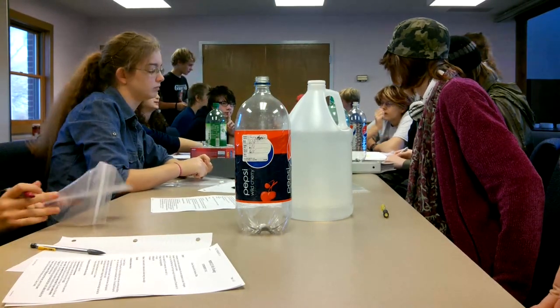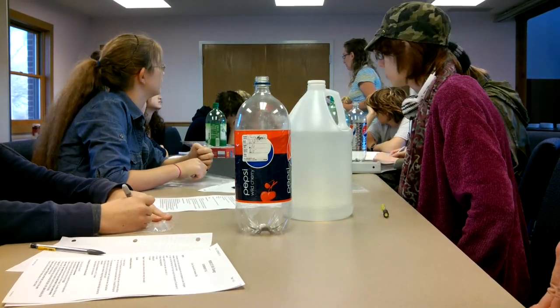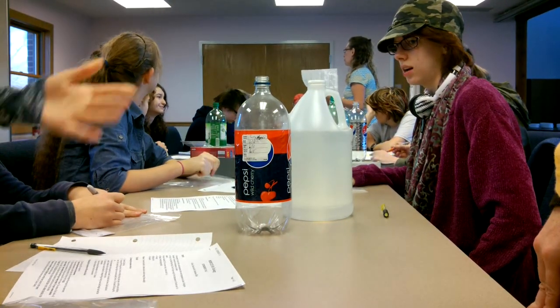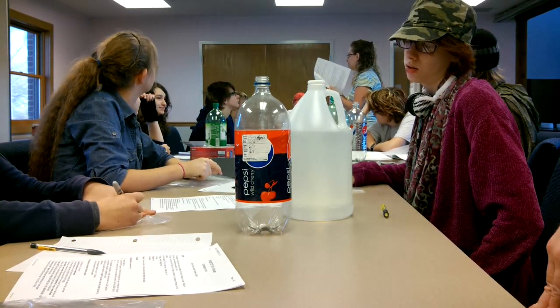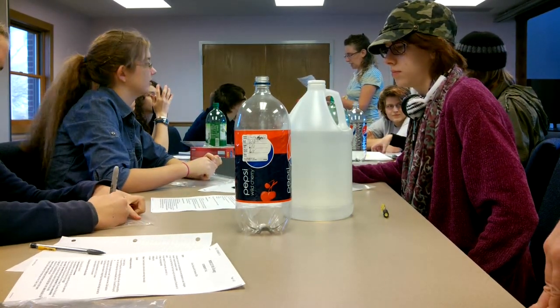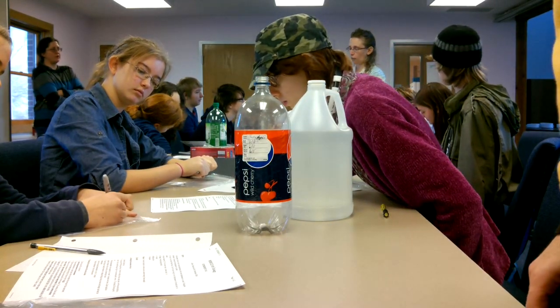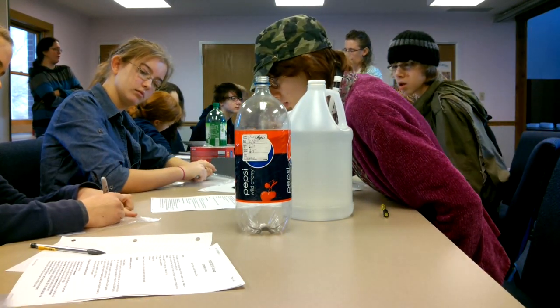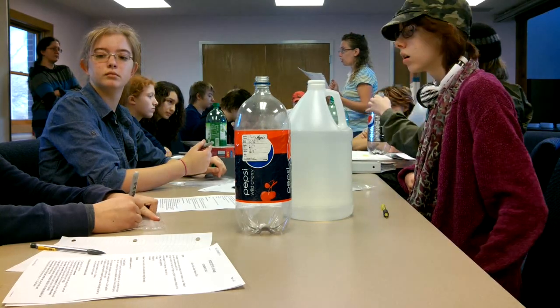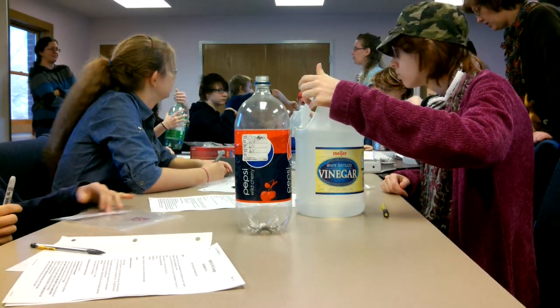To make carbon dioxide, what you're going to do is — I'm on part B here, step four — fill the two-liter bottle about one-third of the way with vinegar. So grab the vinegar and fill your bottle about one-third of the way full with vinegar.